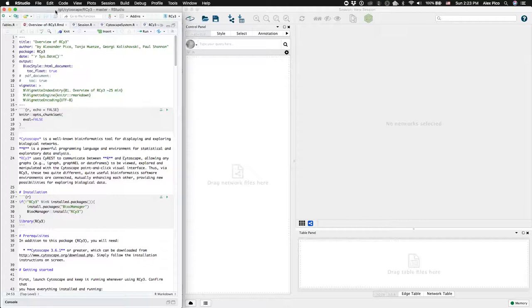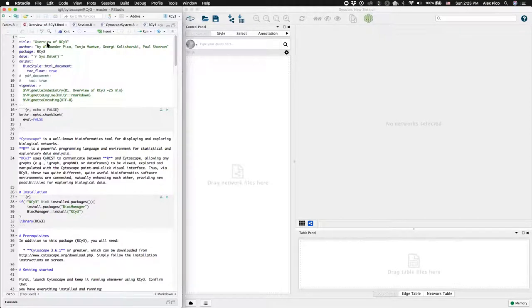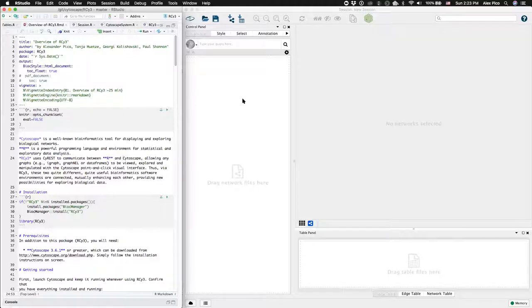This is the overview vignette from the RSI3 package, demonstrating the control of Cytoscape 3.7.0 from within R.